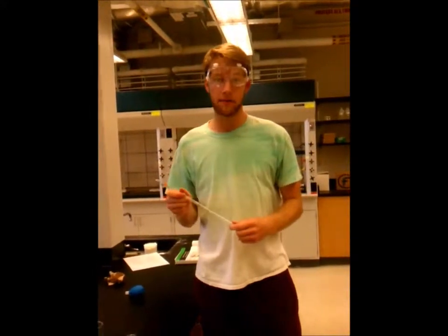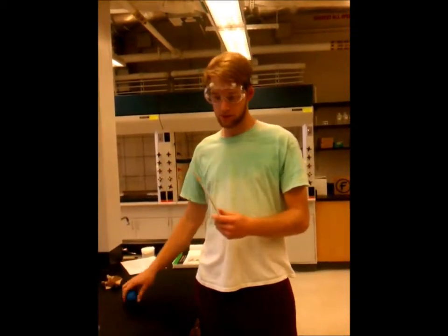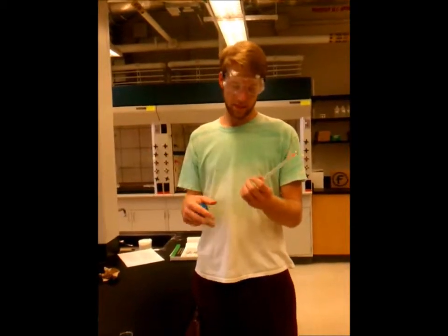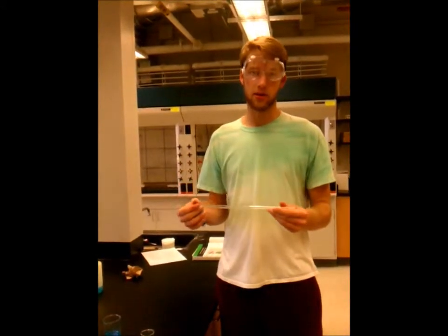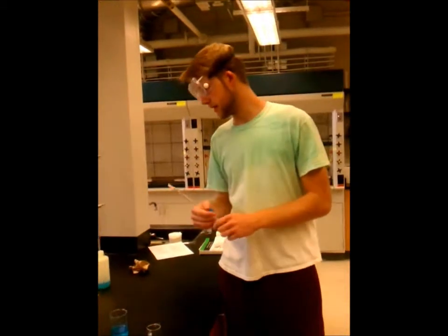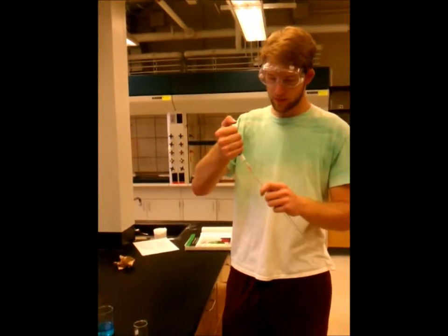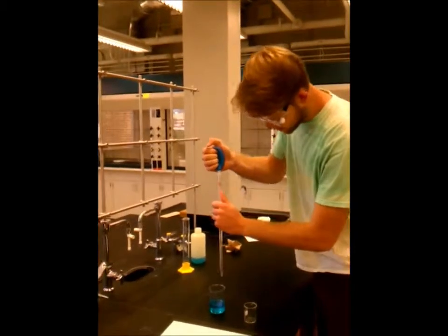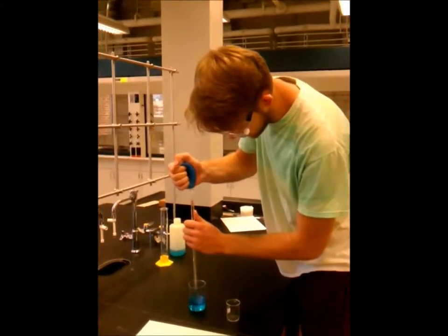When you're measuring with a pipette, the first thing you need to do is clean it. By doing that, you're going to make it safe to use. This is how you get some deionized water, suck up some of the full bulb, suck it up, twist around a few times, let it out. Then you get your solution you're going to use, suck it up 3 times, twirl it around and let it out. Then you're ready to use it. First thing you're going to do is squeeze your bulb, put it on the top so it's secure, and you keep it straight up, and try not to touch the bottom of your pipette.